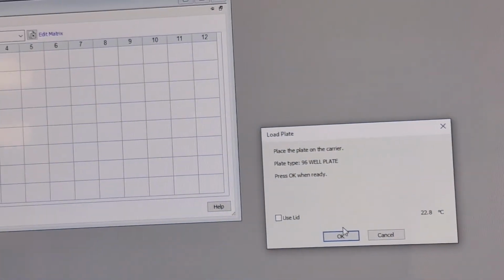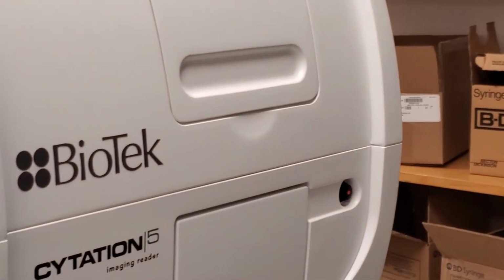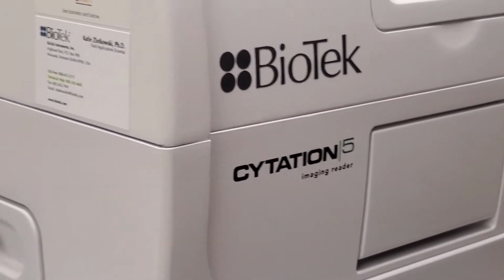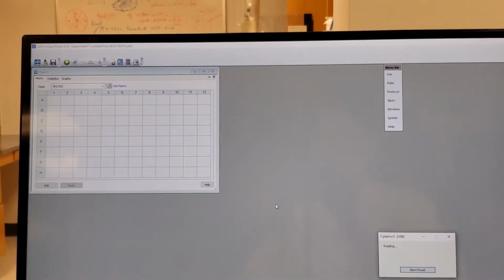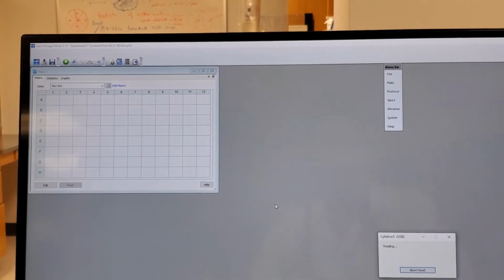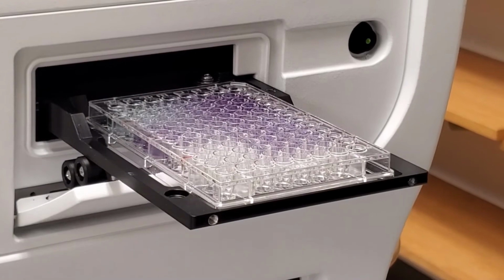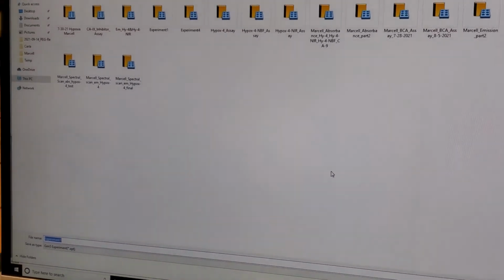All I have to do is come here, press OK, and without touching it, it basically pulls the plate in. I don't have to do anything. I'll read, and once it reads, I'll get my results, and I'll be ready to calculate how much protein I have in my samples to run a Western blot. When the run is done, the machine's going to push back out the plate. So there it is. And then you have this window right here.